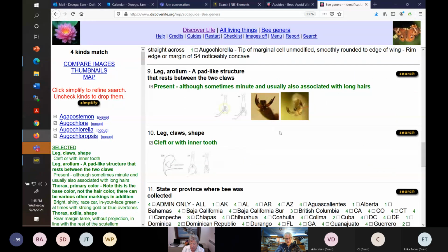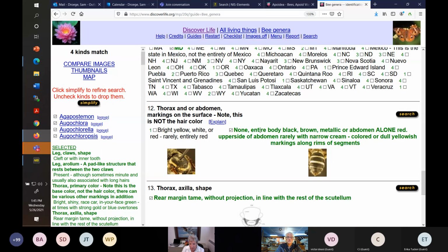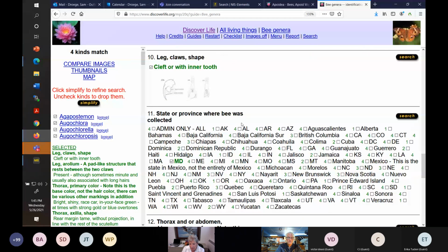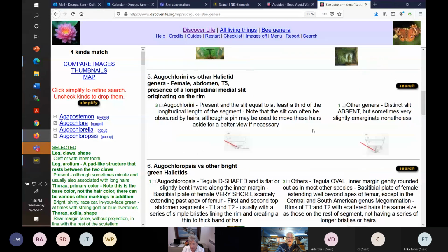Because the genera guide has, I don't know, 200 to 300 characters to handle everything, we don't put them all up on the front page because it'd be too much, and then you spend all your time plowing through everything. So the simplify button has to be there to be helpful.